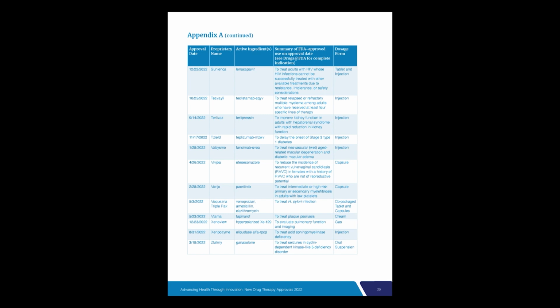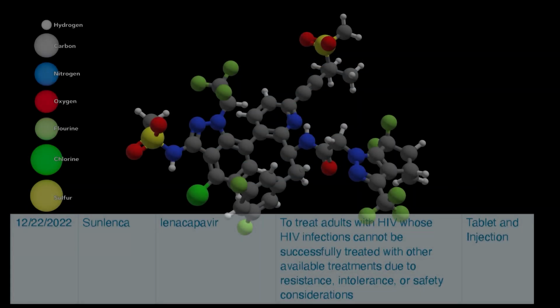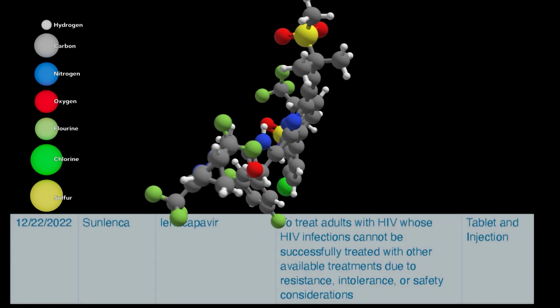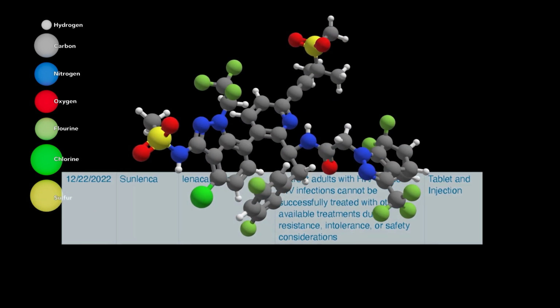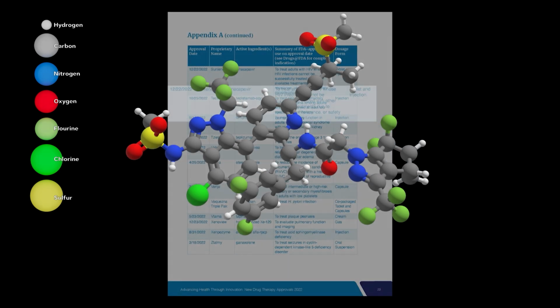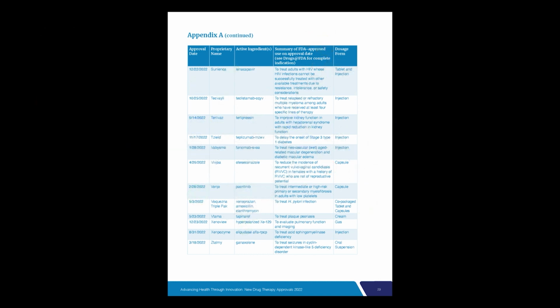And step 6. For chiral separations. Many drugs exhibit chirality, meaning they exist in different enantiomeric forms. That is, they exist as mirror image isomers. HPLC is employed for chiral separation, enabling the separation and quantitation of individual enantiomers. This is essential because enantiomers can exhibit different pharmacological activities, different metabolism rates, and different safety profiles.